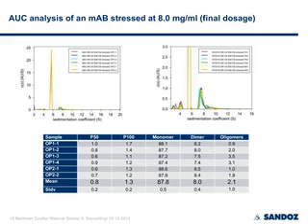You see that you can quantify relatively precisely the P50 and P100 fragment, which is often hard to quantify in size exclusion chromatography because it forms a shoulder only to the monomer.